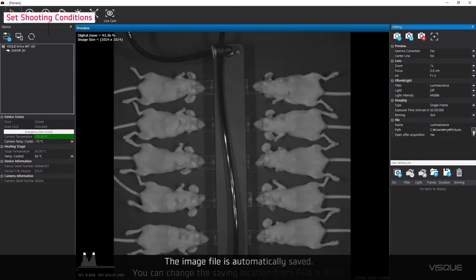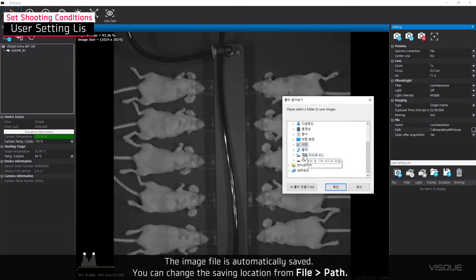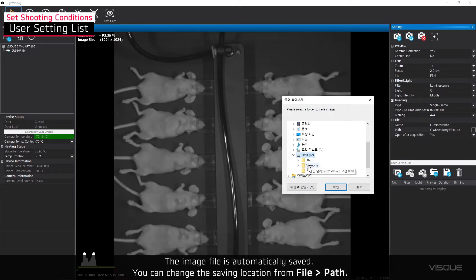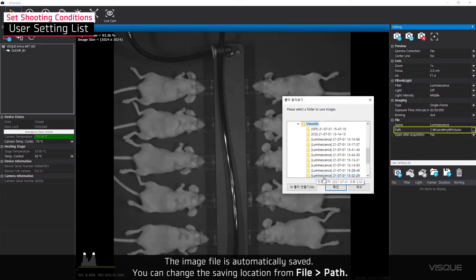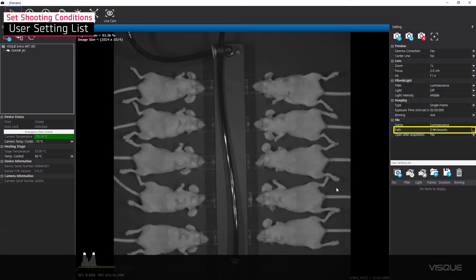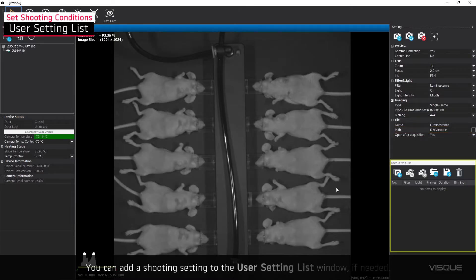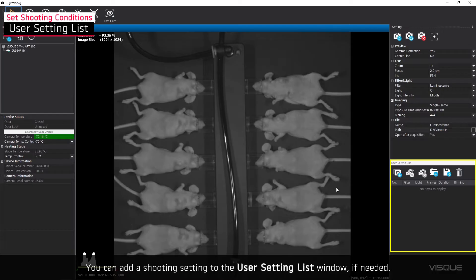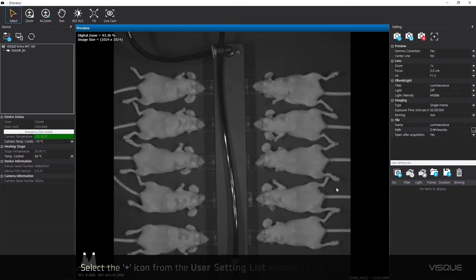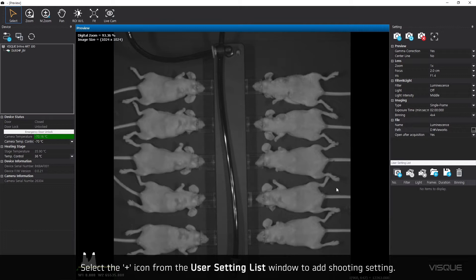The image file is automatically saved. You can change the saving location from File Path. You can add a shooting setting to the user setting list window if needed. Select a plus icon from the user setting list window to add shooting setting.